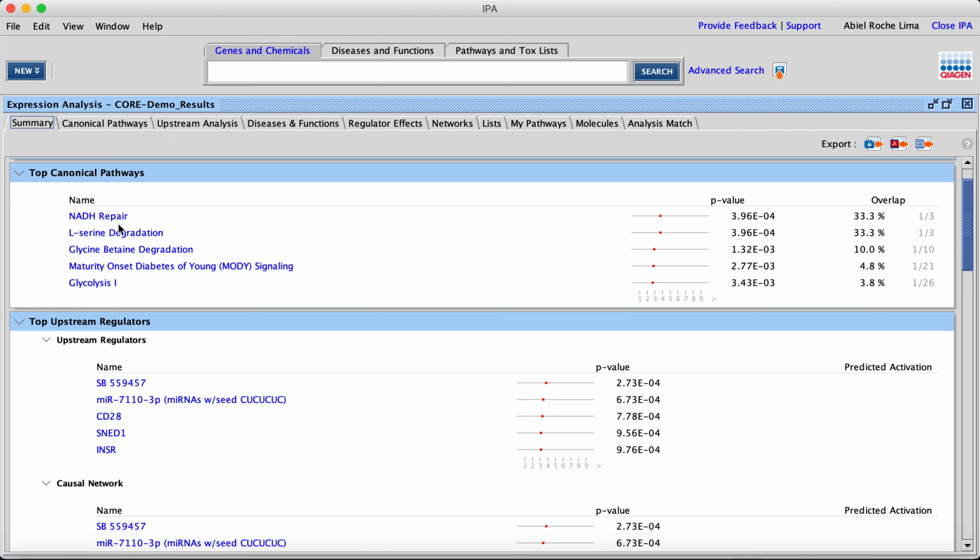work in terms of, and I repeat that term that some people in the community use, fishing, to try to connect your hypothesis with the results of the enrichment analysis you're doing using IPA in this example, and try to get an understanding of why that protein was significant in your hypothesis, and why that protein was considered important for biological significance.